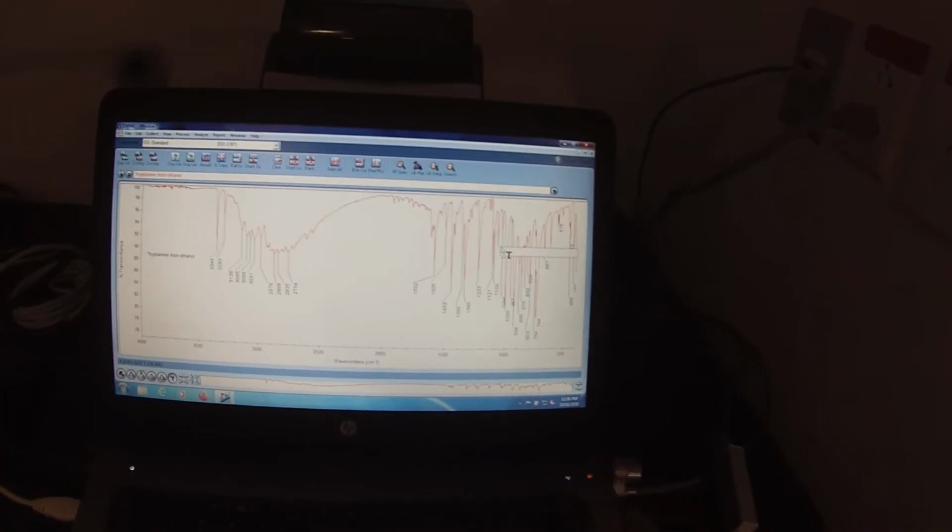And then we've got some other peaks that are probably less well defined. 1434 is small. You can get rid of that one. This 1366, 1346, 1233. There's some carbon nitrogen stretching in there. So, and then these little tiny peaks at 1077. We can get rid of that. Right, this peak is obviously not significant.